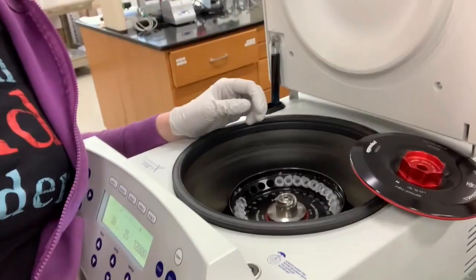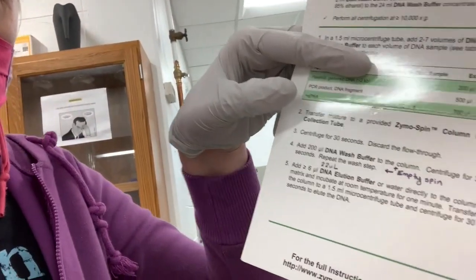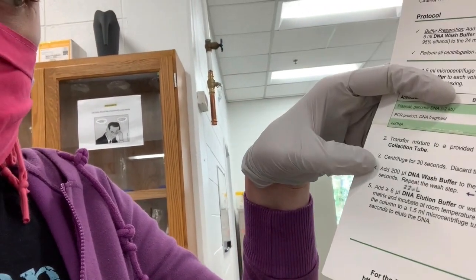So I have added 200 microliters of DNA wash buffer to each tube, and I've placed them back in the centrifuge. I'm going to put the lid back on, close the centrifuge, and hit start and centrifuge again. If you look at the protocol, it will also say on step 4, repeat the wash step. So after this spin, I'm actually going to just add 200 microliters more of this buffer to each tube, or to each column, without taking them out of the centrifuge.